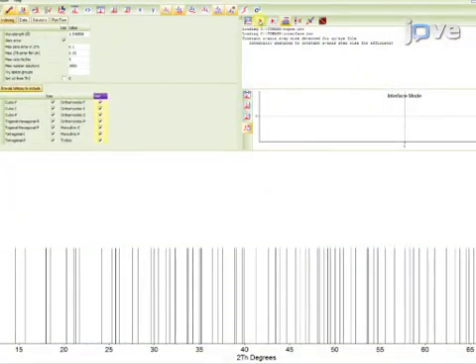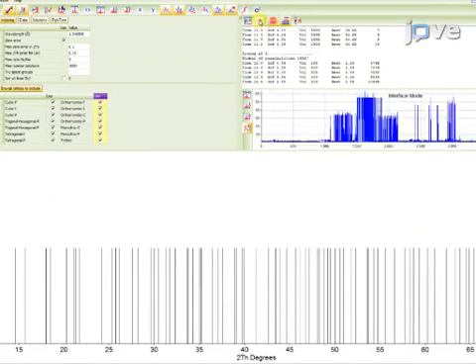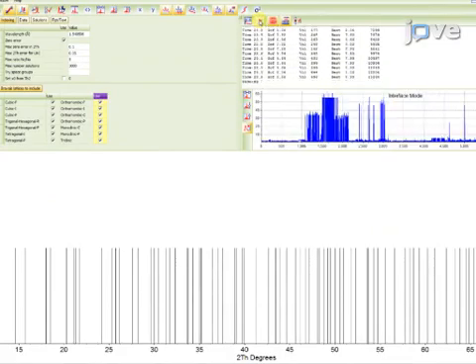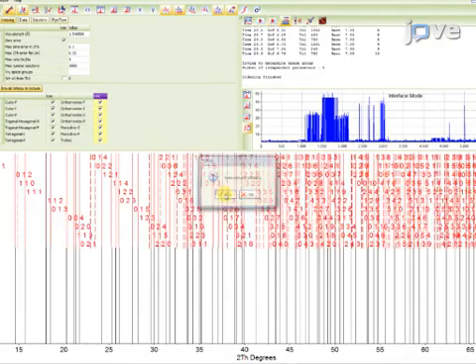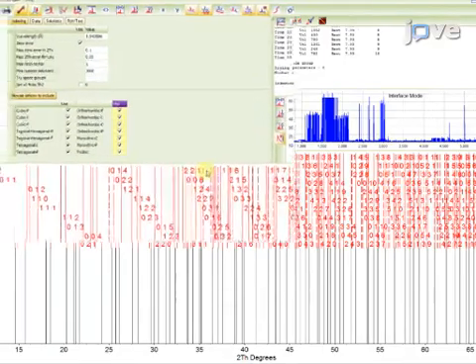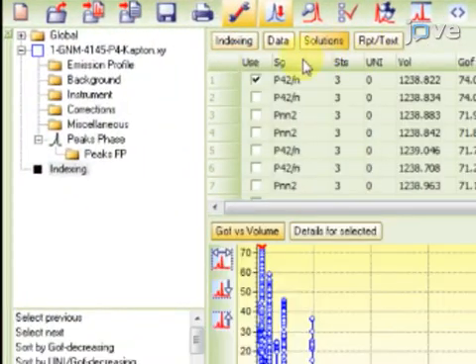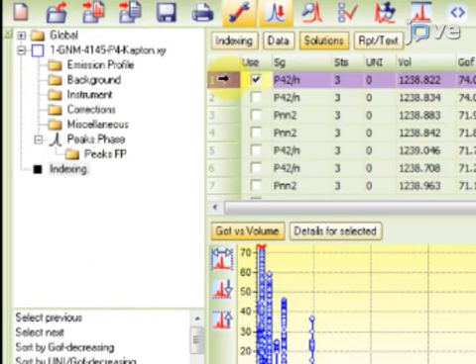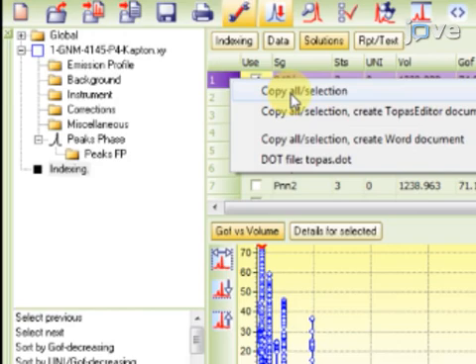Following this, press the Run button, and click Yes to keep indexing solutions. Press the Solutions button, and then highlight the first solution by left-clicking button 1. Now right-click on the highlighted solution and copy the selection.